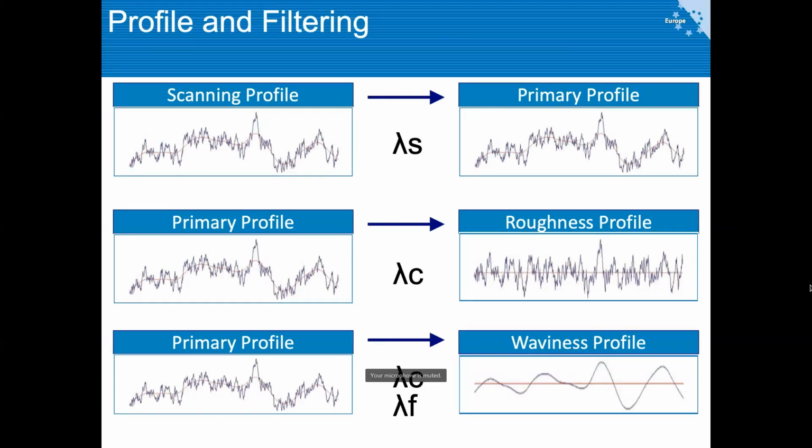For instance, this specific measurement which we have here was measured with the ventilator off in order to reduce these small oscillations, but regardless of that, it anyway applied this small noise reduction filter. And if you compare this scanned profile and this primary profile, you can't actually tell any difference because those oscillations are so tiny that you can't even see them with 5 or 10,000 times magnification.